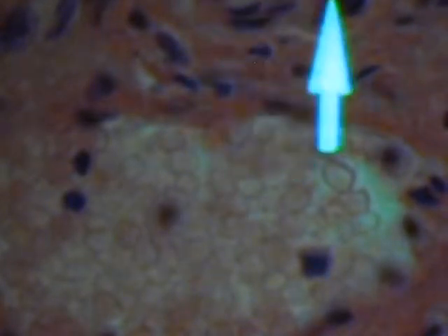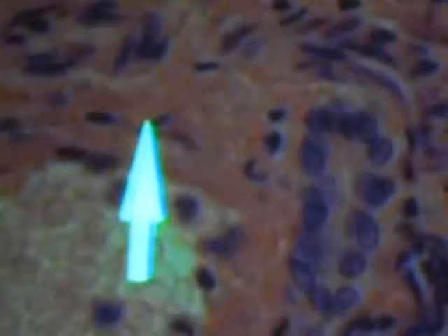So we see our endothelium here. We can see the nuclei of the muscle cells there. And then we see the bile ducts, our simple cuboidal epithelium. So this structure here would be our portal triad. We have the 3 structures sitting together. Remember, this is a rabbit liver too, or pig liver.